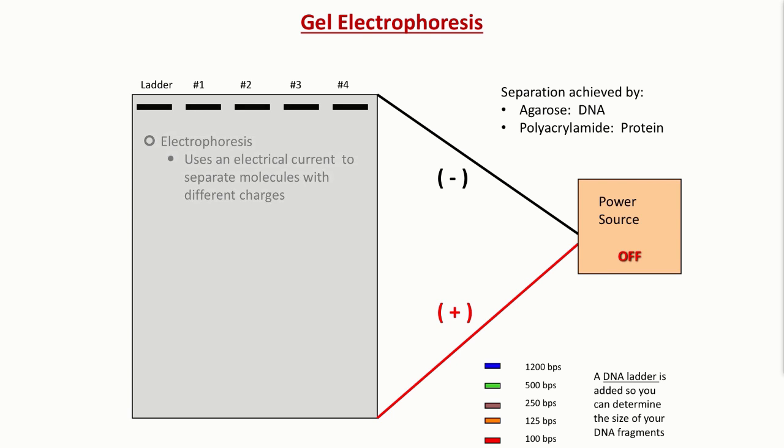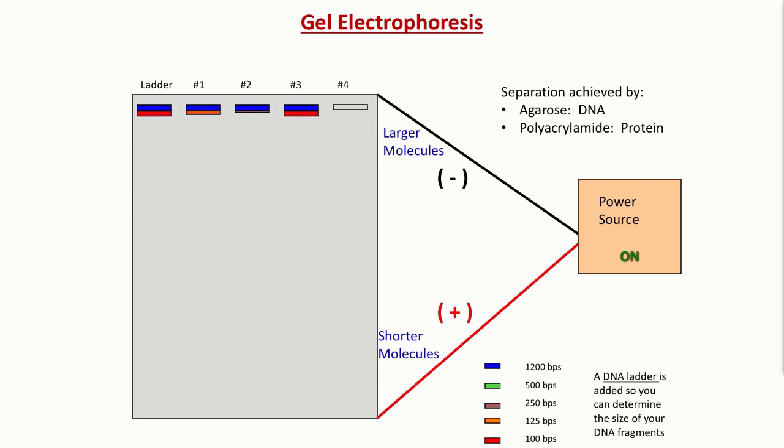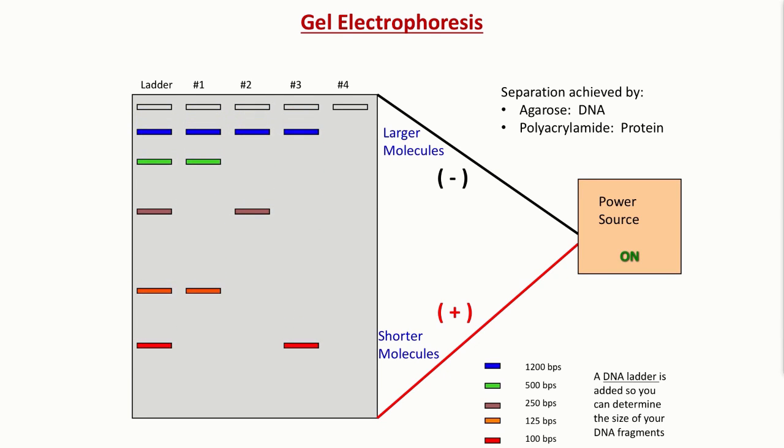When I turn on the power source, my DNA molecules are going to migrate. Because DNA is negatively charged, it is going to migrate towards the positive end of the gel. The agarose is going to separate the molecules according to size.